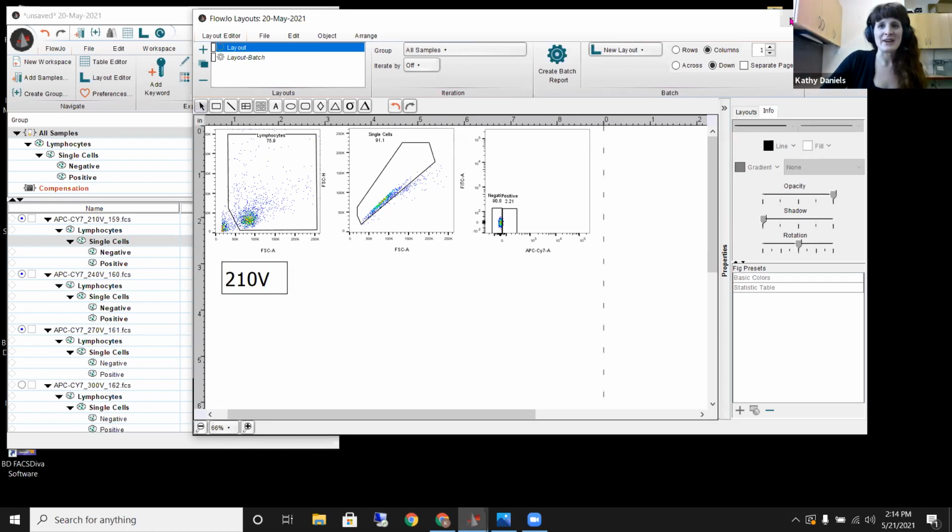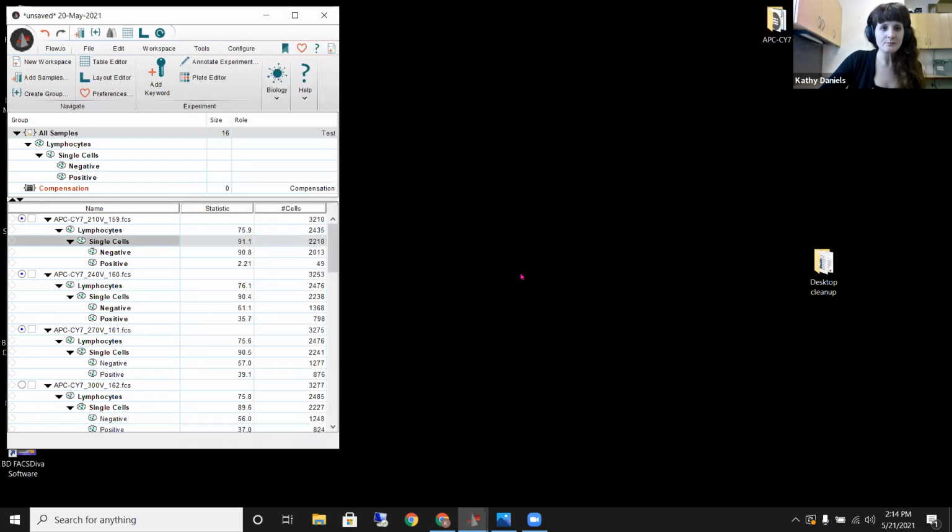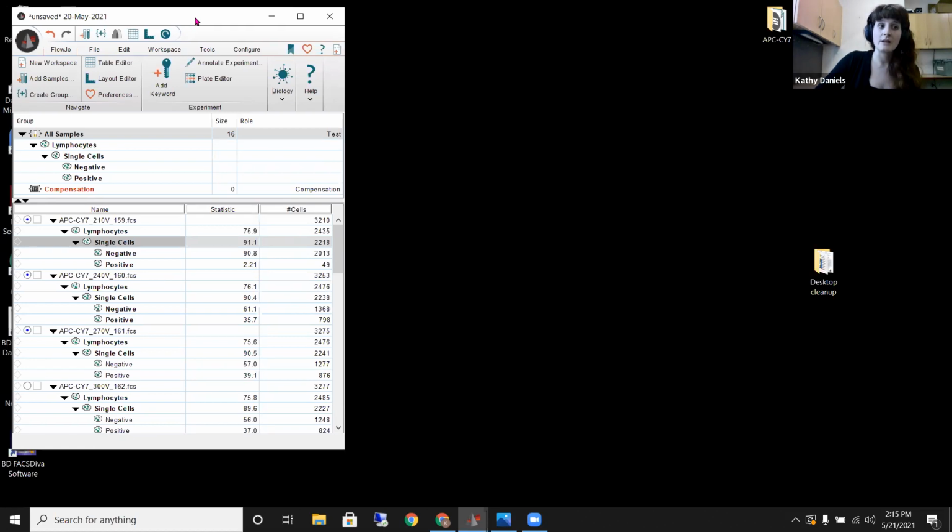Awesome, thank you. Okay, so from there, I'm just going to minimize this layout editor and we can come back later if we need. And what I want to focus on at this point is the statistical analysis. So FlowJo gives us the capability to carry out statistical analysis. And going back to an earlier question about analyzing your samples in DIVA, it's not as straightforward. It's not as easy to do a lot of things in the acquisition software. And that's for many acquisition softwares, not just one. And we can utilize these analysis softwares specifically to help us do an easier analysis and statistical analysis.